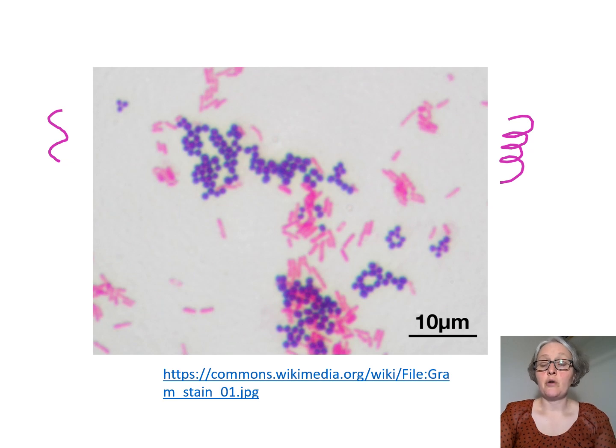With prokaryotes, we always want to identify them in 2 ways, by morphology and by stain. So let's practice this in a couple different ways. Morphology is just a way of saying shape. If you see prokaryotes that are spiral shaped, we call that spirilla. If they are lines, we say that's bacilli. And if they are dots or spheres, we say those are cocci.